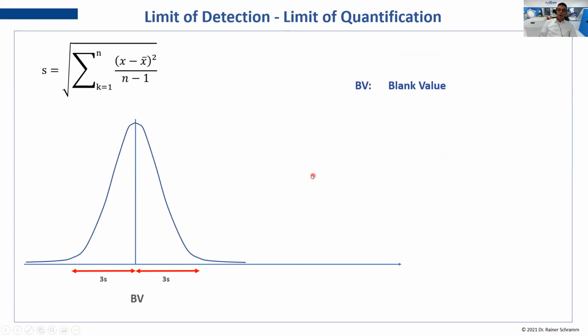Okay, now let's have a look into the limit of detection. How can we calculate this? The best thing you can do is measure a blank. But what does a blank mean? I give you an example.